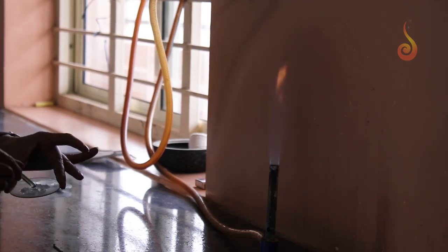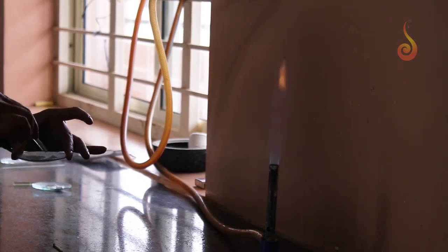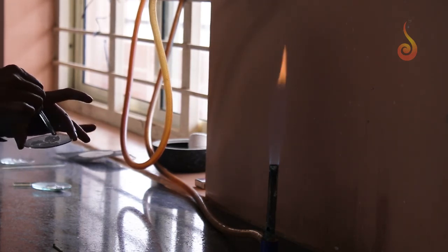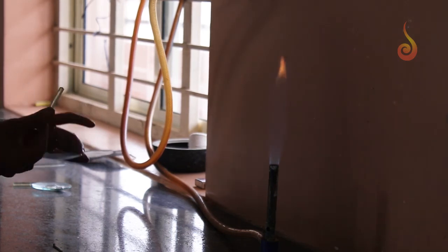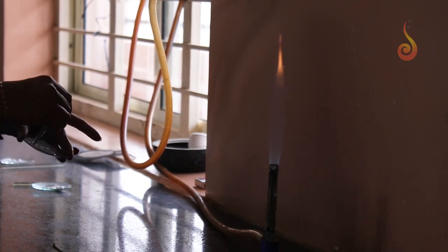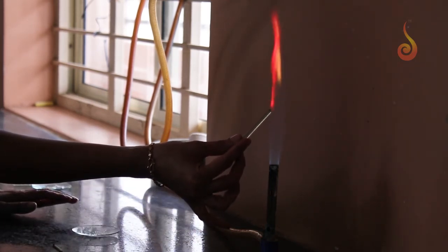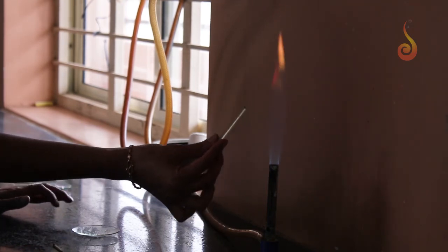What is the flame color for strontium radical? I already mentioned it's nothing but crimson red color. How is the crimson red color observed? Now we have prepared the paste using concentrated HCl, and the paste is held in a flame. Beautiful crimson red color we are observing, which is indicating strontium ion.